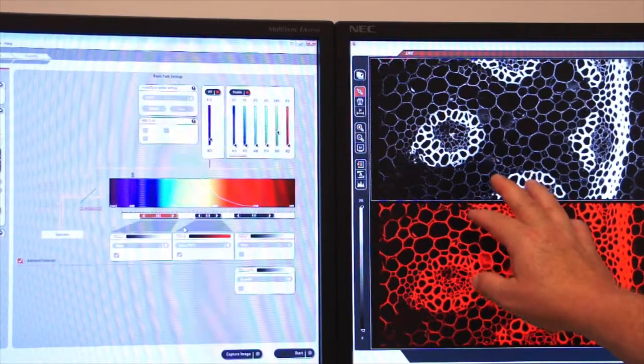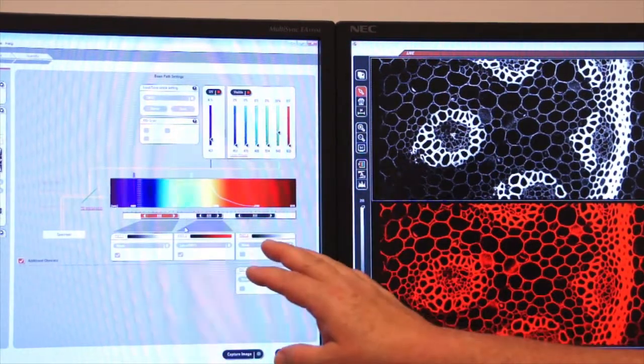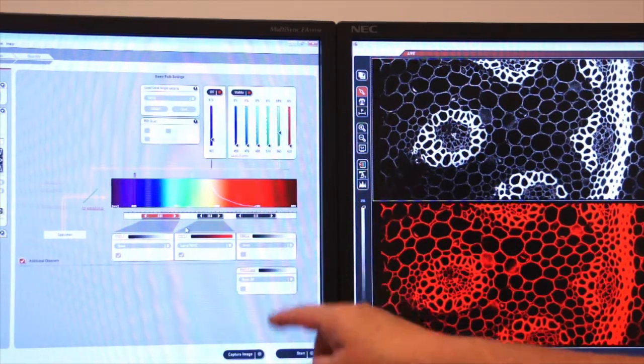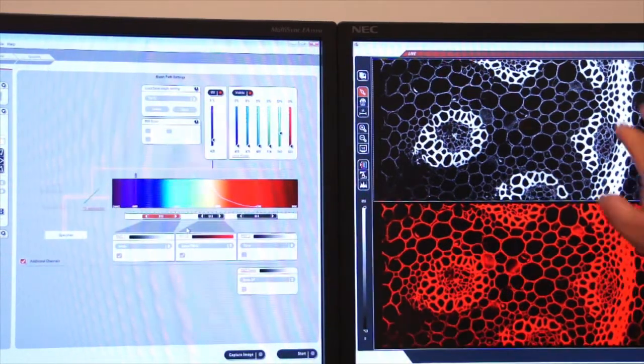Always be aware that you can activate any one of these laser lines and turn on the PMTs to find information in that area of the spectrum.